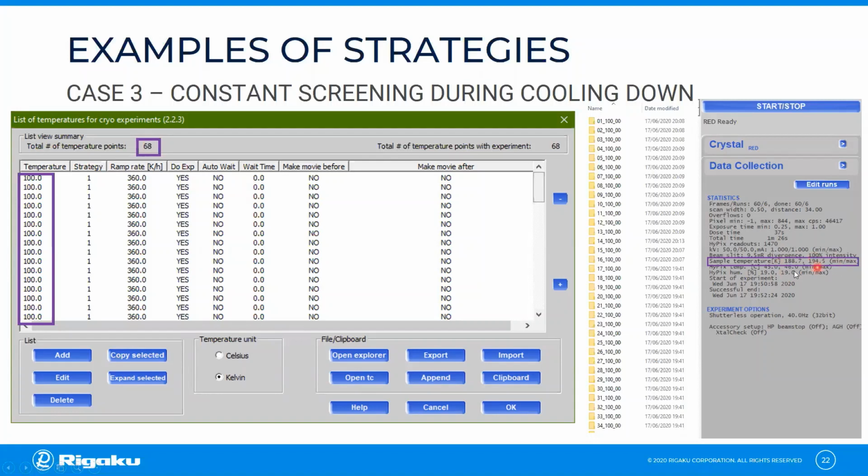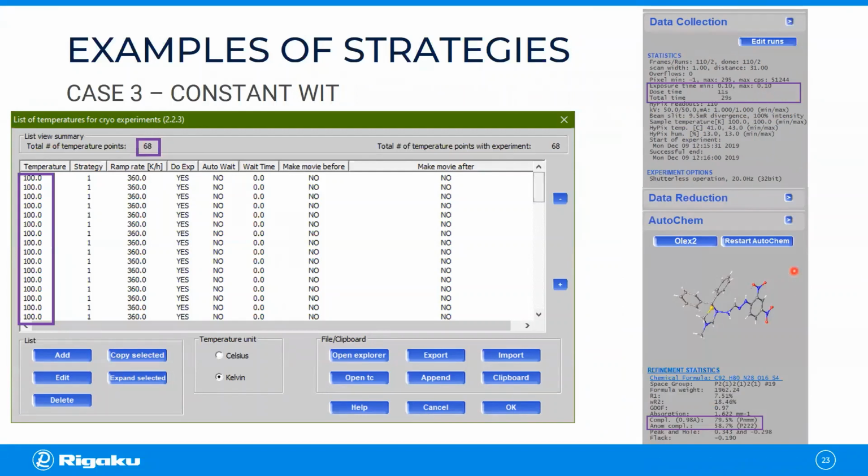The temperature average one. So this will allow you, if you choose just a file scan or just a screening scan, to very fast go through an extremely large range of temperature with small steps, and then realize where exactly the phase transitions happen in the ranges of temperature. So it's not only screening.